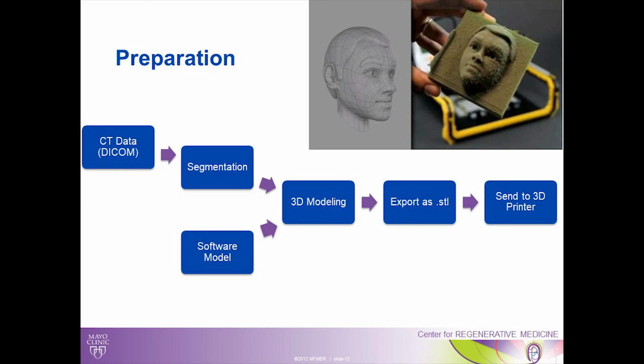And then you can take the software and you can change the shapes of those. So if I want to take maybe an ear, and I'm taking the right side, but it has to have a little bit different shape on the left, how can I modify that in the software? And you can go through that process. What the FDA wants to see is, okay, for one patient, I take that CT scan, and 20 different times I can go from their CT scan to getting that ear to look at exactly the exact same, all 20 of those times, the exact same process. So there's reproducibility in that process.